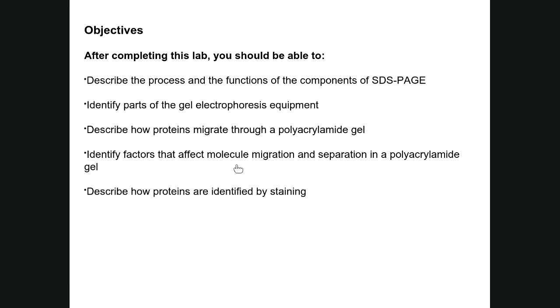Identify factors that affect molecule migration and separation in polyacrylamide gel electrophoresis. So these two basically go together, and then describe how proteins are identified by staining. We'll talk about a chemical stain called Coomassie blue.